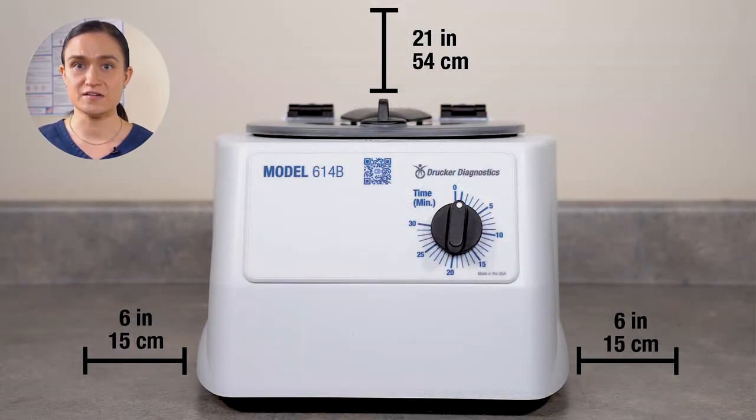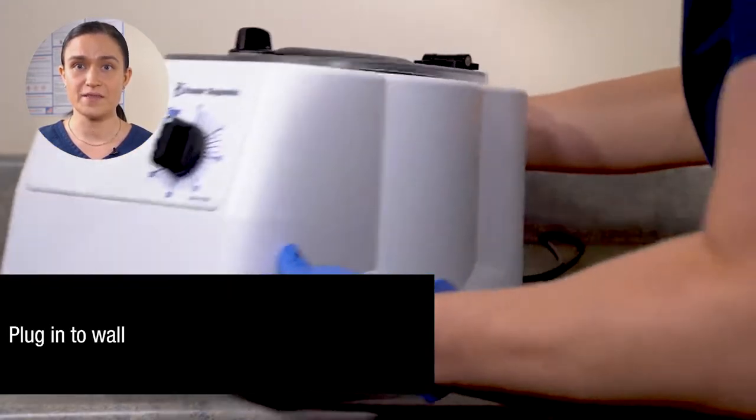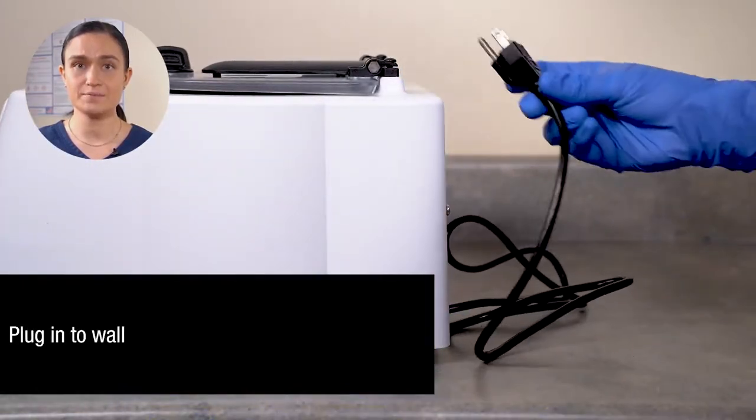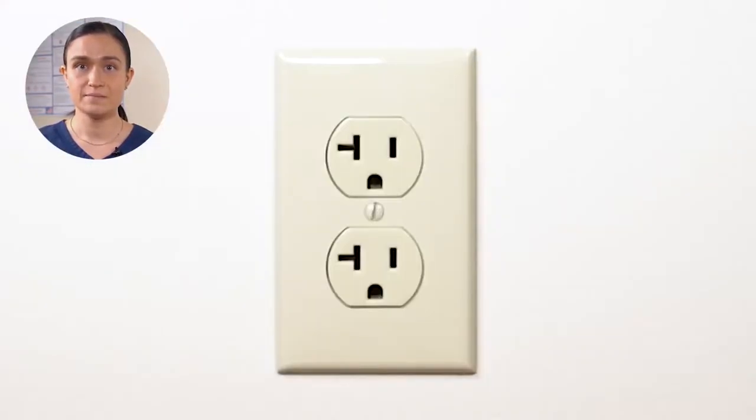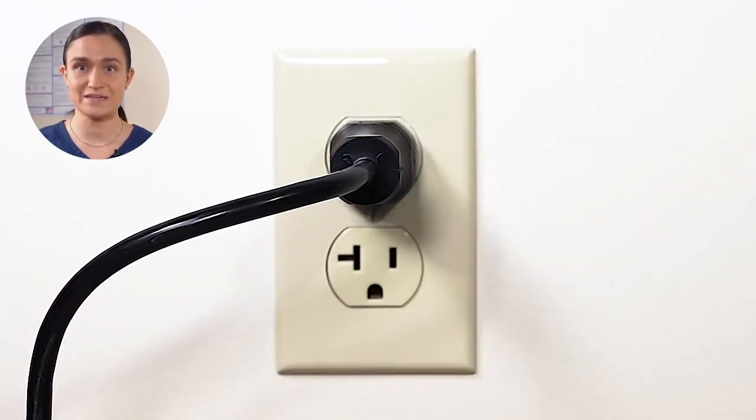Start by placing the centrifuge on a flat, level, sturdy surface. Leave at least 6 inches or 15 centimeters of space on all sides and at least 21 inches or 54 centimeters of height above the lid so that you can easily open it. Locate the power cord on the back of your 614B and plug it into the wall. Make sure your outlet is easily accessible so you can unplug your centrifuge for cleaning and maintenance.